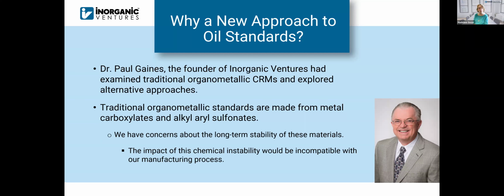Traditional organometallic standards are largely made from metal carboxylates and metal alkyl aryl sulfonates. What Paul found was that there could be long-term stability issues with these materials. So we know that our aqueous metal standards are extremely stable.